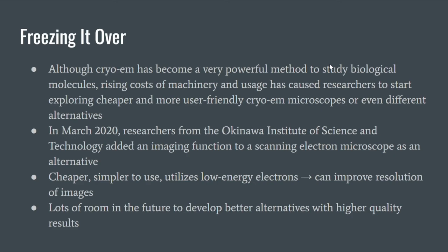And in the future, we have a lot of room to improve upon our cryo-EM and other techniques for imaging of cells and other biological specimens, and this can help decrease the cost and increase the quality of our results.